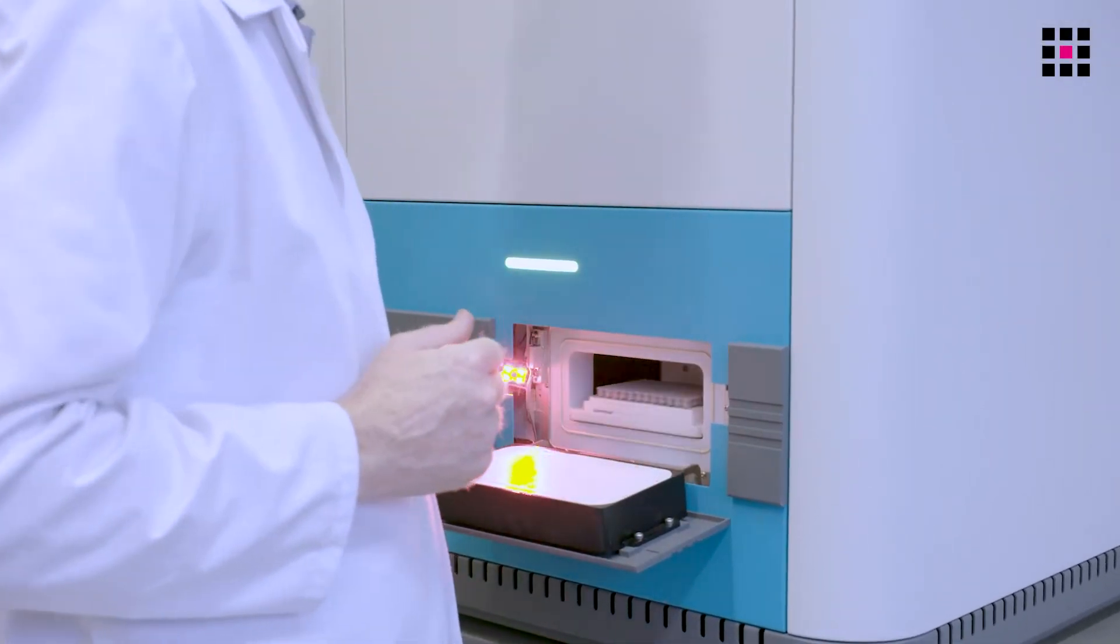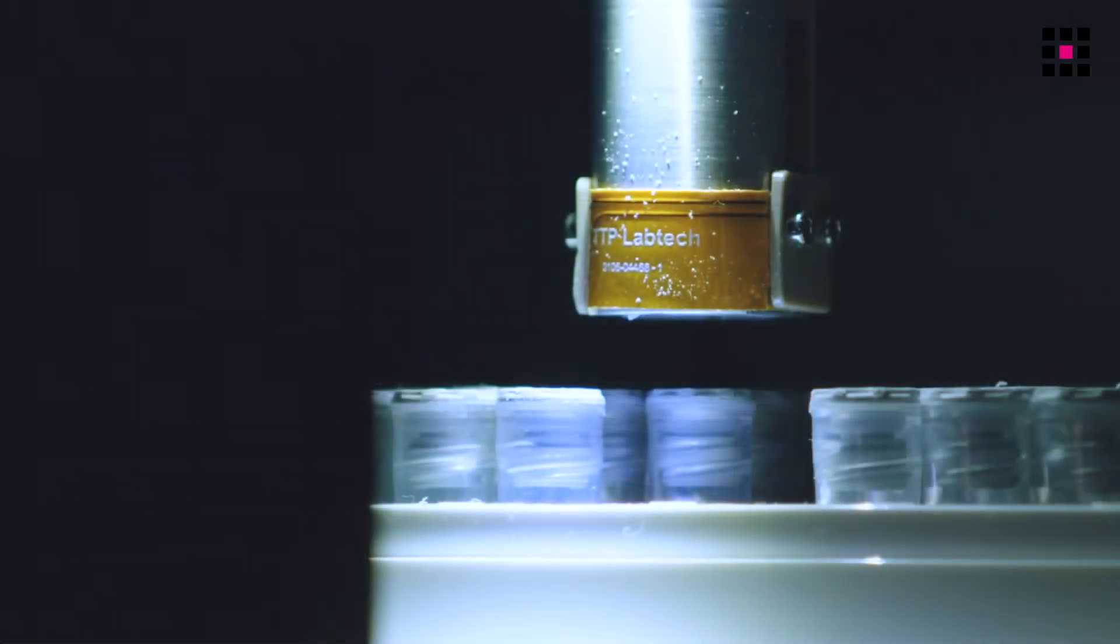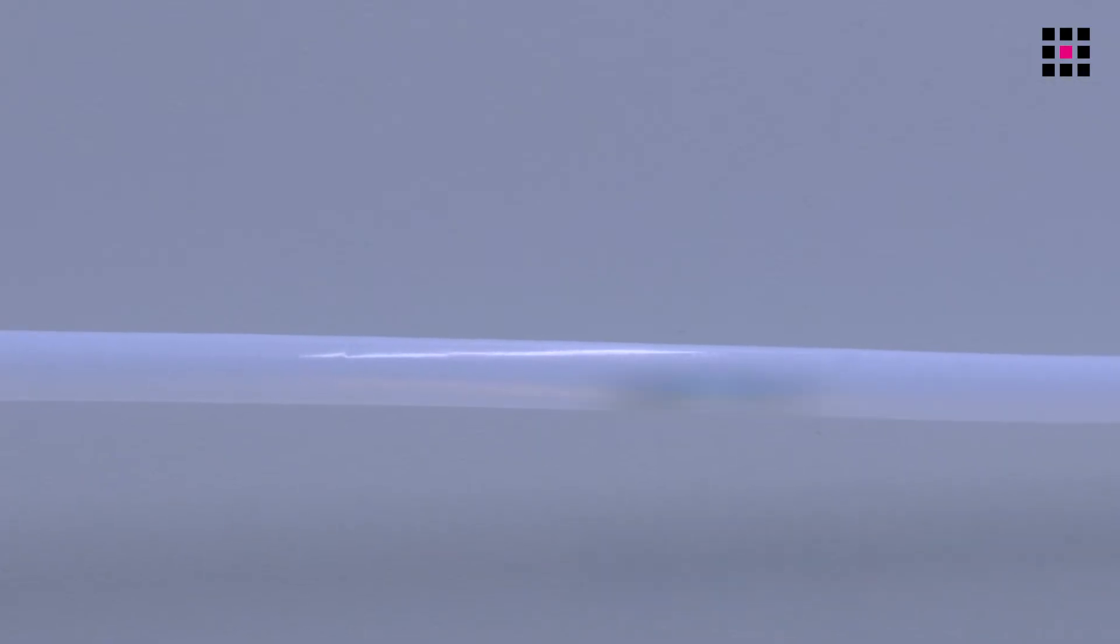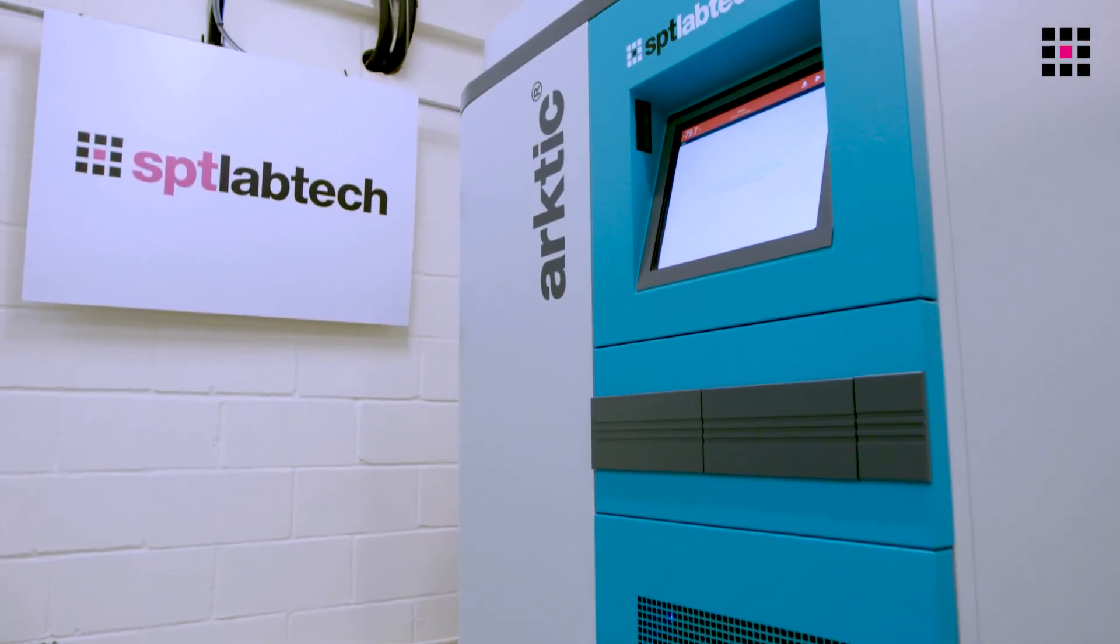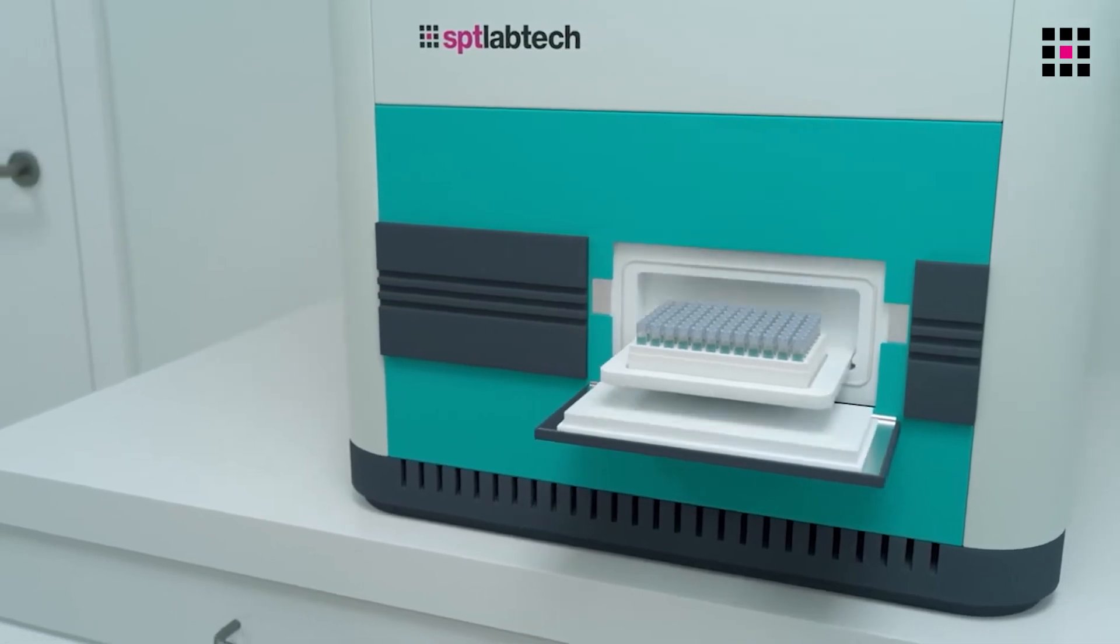This is a plus four degree temperature store, which is automated in sending the vials through the external transport system to each individual Arctic as a module system.